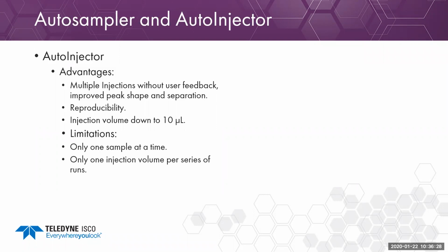You can modify the injection volume after the fact, I guess. And then you need to wash the auto injector probe following a sequence on the system there, so that it doesn't get clogged up or precipitate out to clog it up.